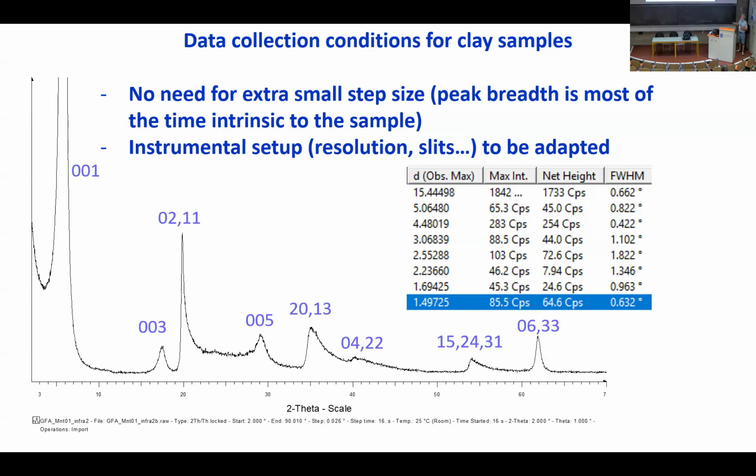And if you want to investigate this sample in detail, maybe it's worth discussing with the people in charge of the diffraction machine and telling her or him that I want this and that specific, or I want to determine what are the best conditions for my sample, because I want to have the best diffraction data for this specific sample. And this is extremely important. It's not because people have been doing things, I would not say in the wrong way, but doing that for decades, that they have to continue on your sample.